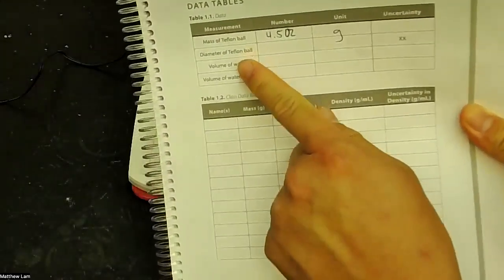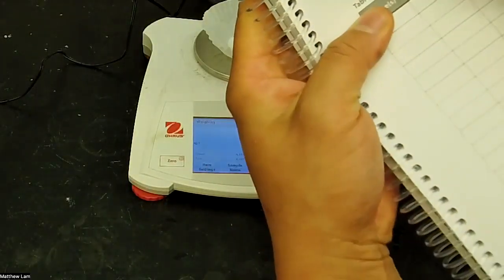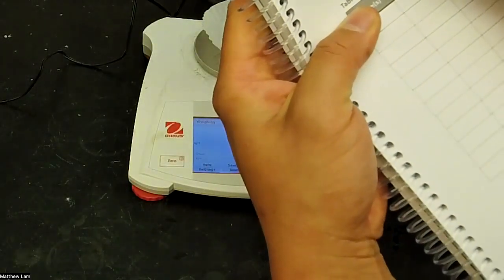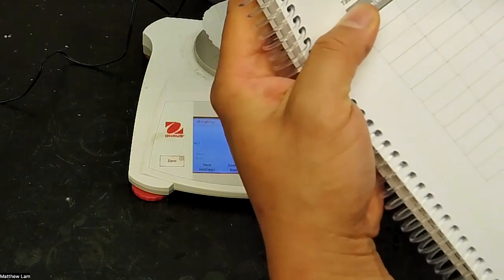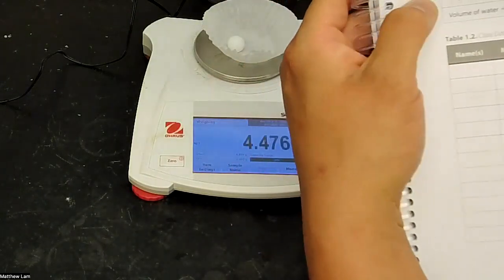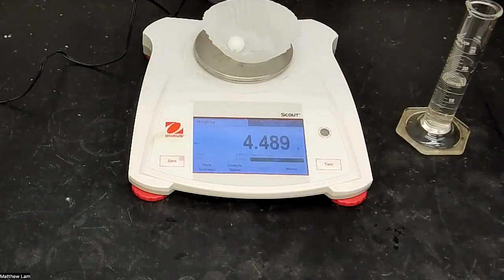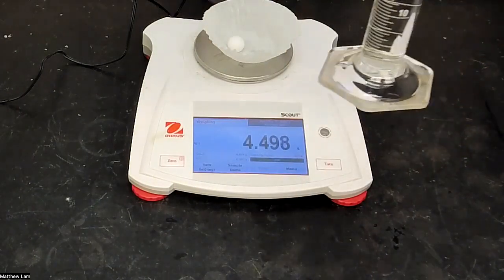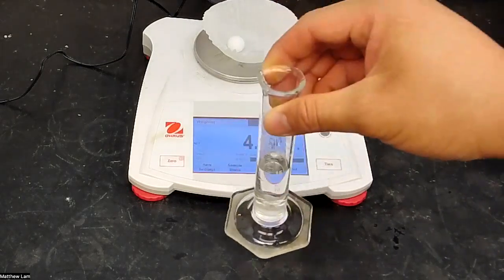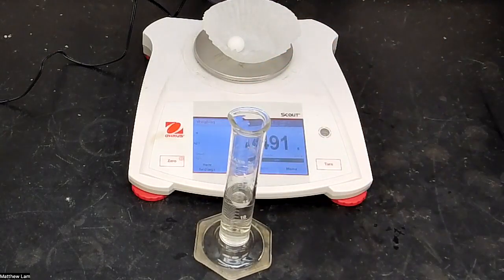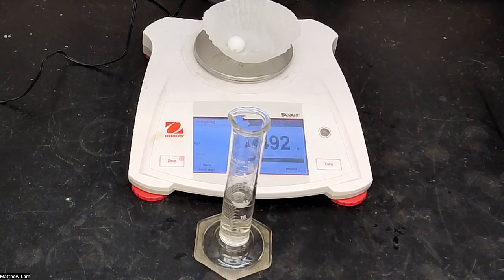The diameter of the Teflon ball was already given. It's five-eighths of an inch. And then the volume of water before we put in the ball—so we want to determine the volume of water in this before we put in the ball. So I'm going to adjust the camera really quick so it's level with the graduated cylinder.